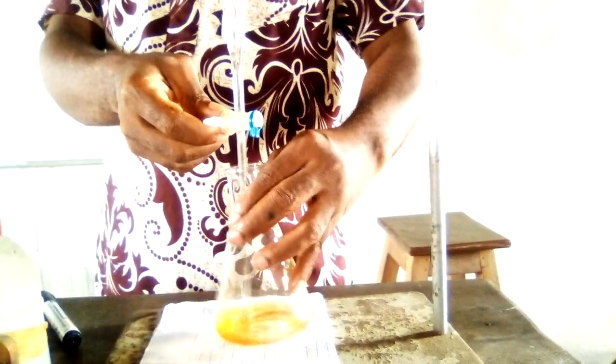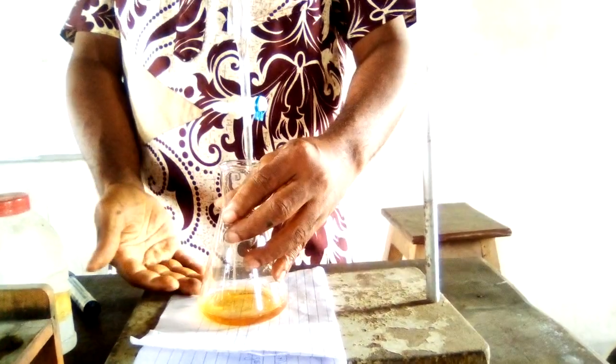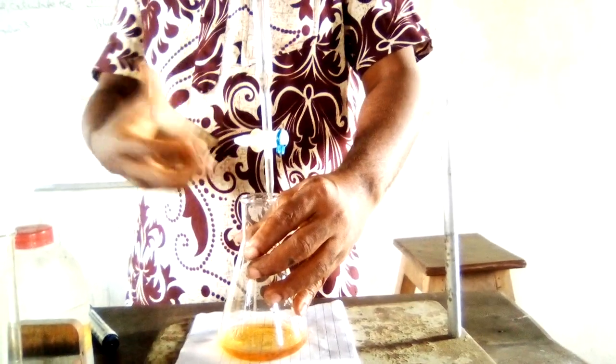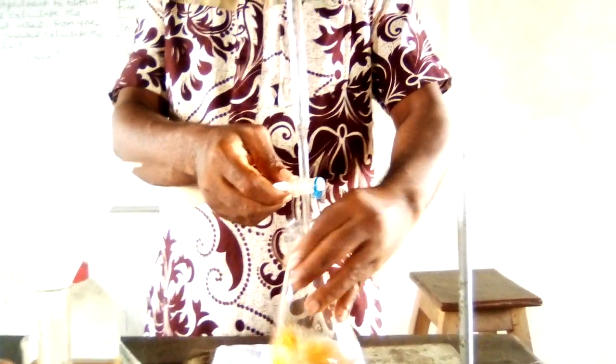As you titrate, you swirl the flask little by little, while you place a white paper under it, a white tile. The essence of the white paper is to ensure a sharp color change. So you now have the titration.